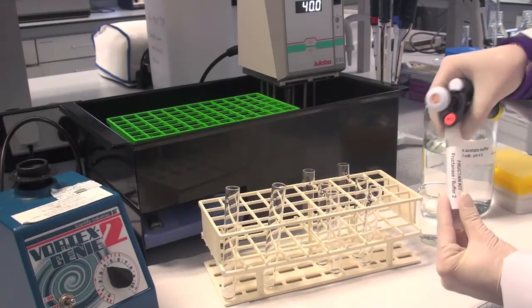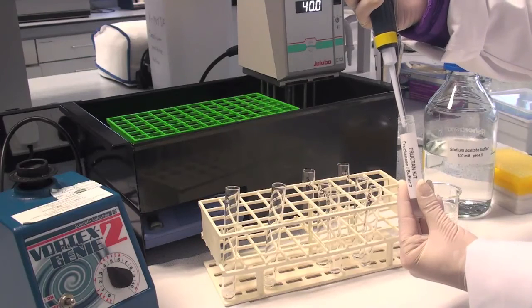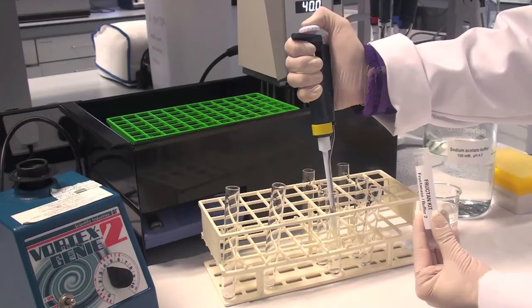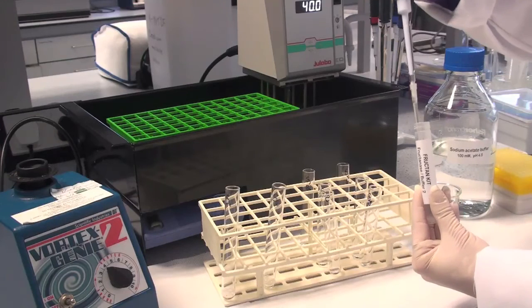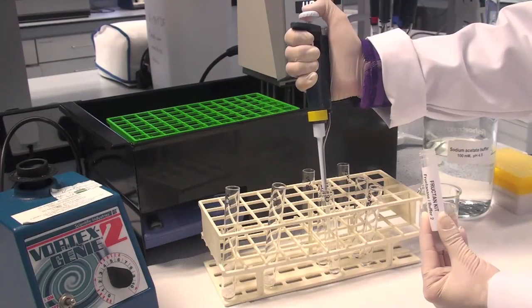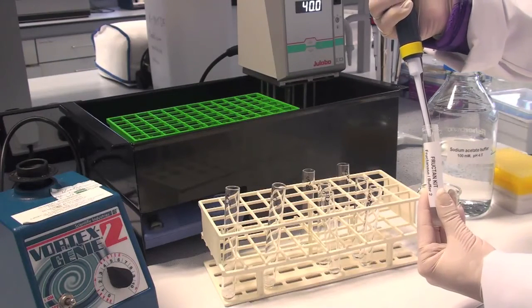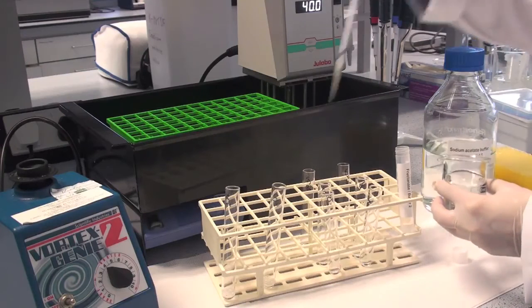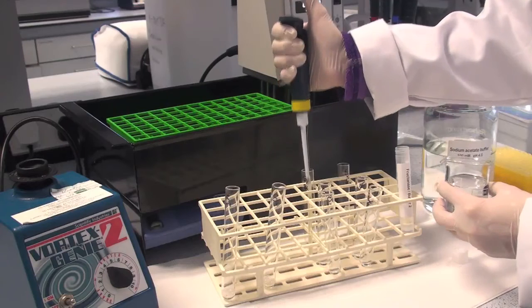Add 0.1 ml fructanase solution, enzyme solution B, to two of the tubes for each of the samples. Add 0.1 ml of 100 millimolar sodium acetate buffer to the third tube from each sample. This is the sample blank.